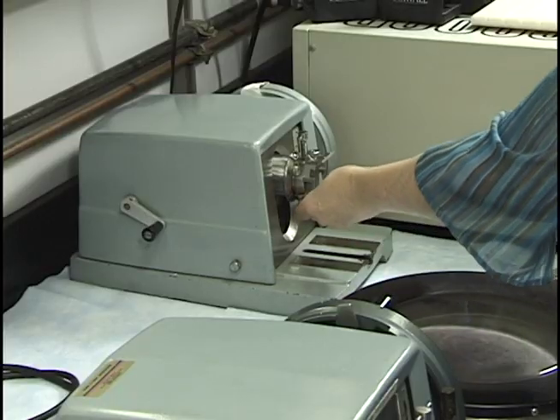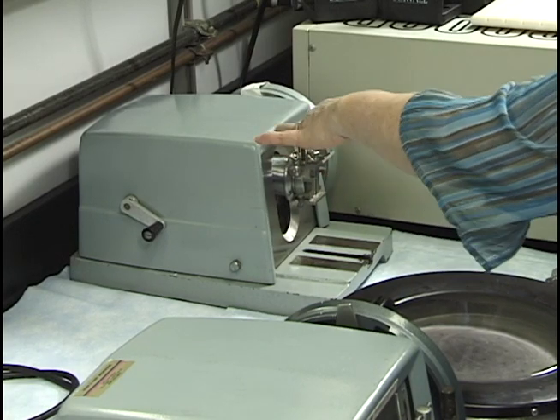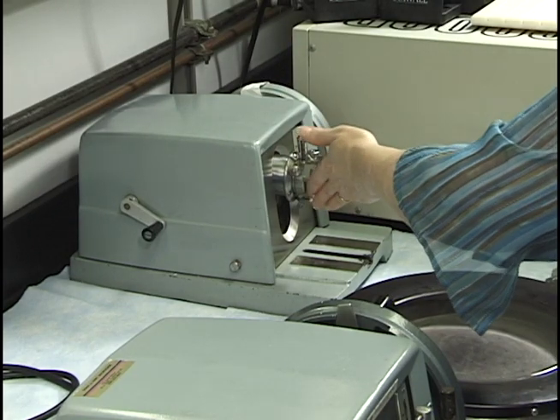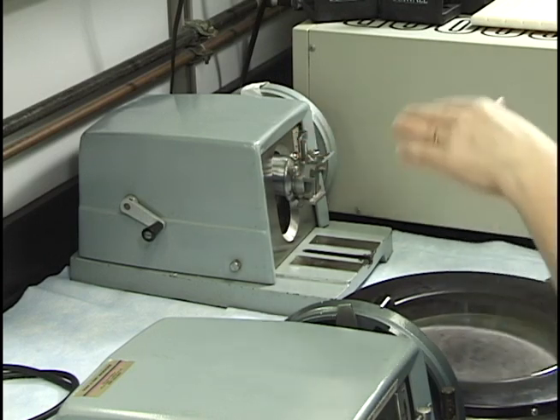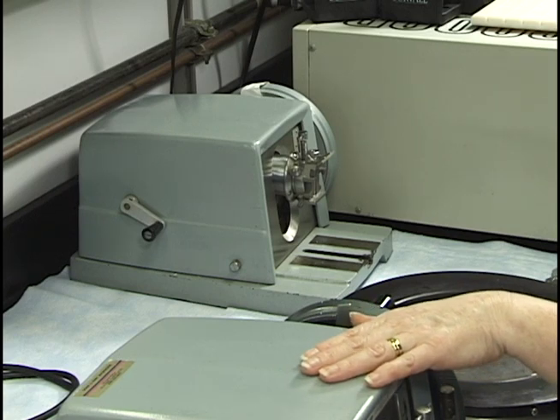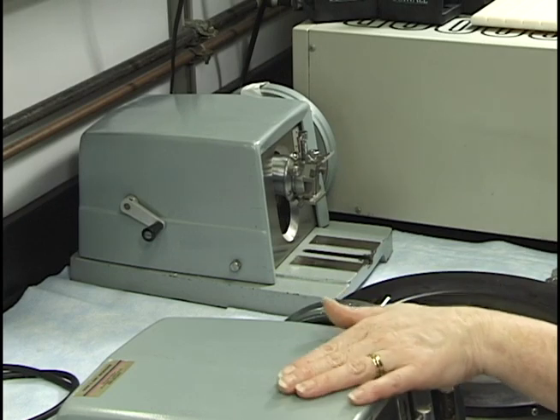Again, I really encourage you to come over and fool with this and try tilting it and adjusting it and seeing how that works and adjust your block face. You can just see how that mechanism works. And once you have a good idea of that, then come over and use our good one. And really it should be only minor tilting or minor adjustments on the one that we have set parameters on.